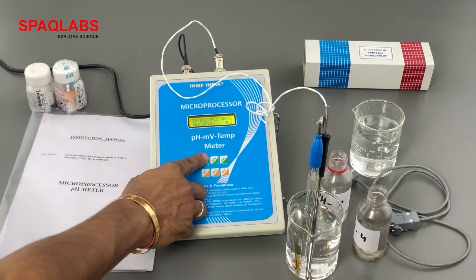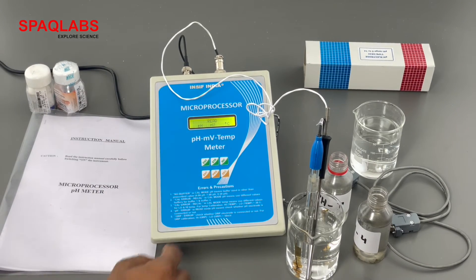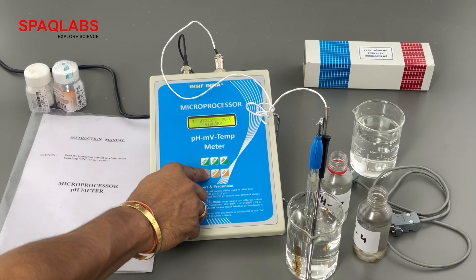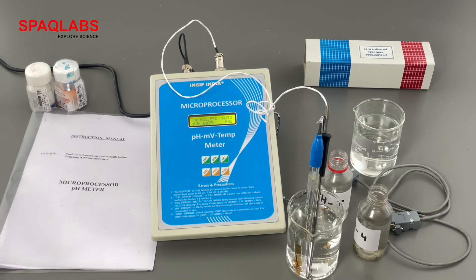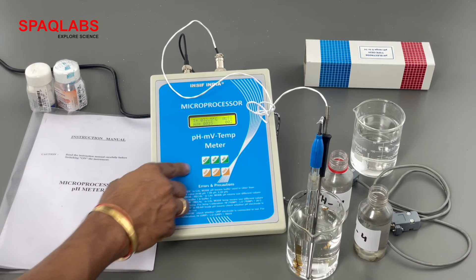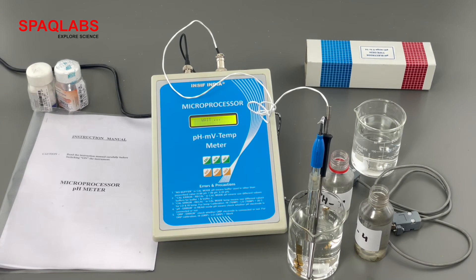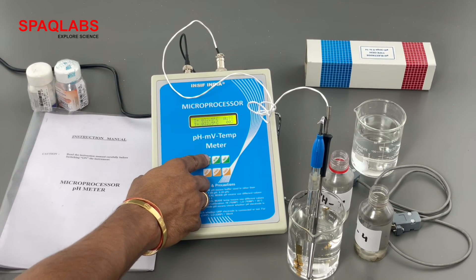Now let's see how to take other readings. Press escape, then press enter to read. Change the cursor to MV and press enter to get the MV reading. Then change the cursor to C (temperature) and press enter — this shows the temperature of the sample. Press escape when done.